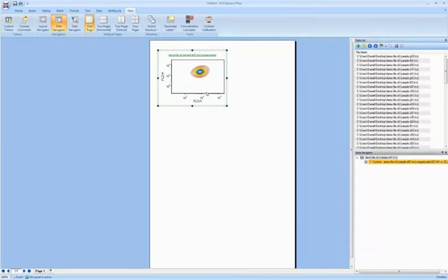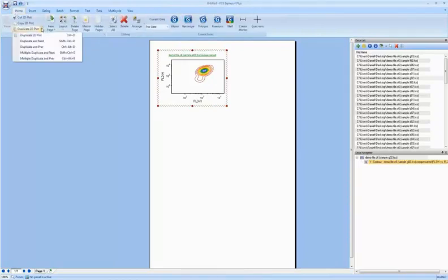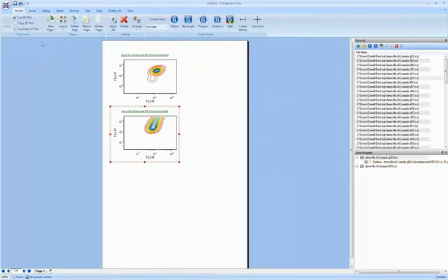And if I try to batch from this plot to the next file, it should switch to G02. As I go into data, I'm going to click next, and it switched to G02, and our Data Navigator updated as well. If you want to actually create a new plot with the next data file, all I have to do is go duplicate and next, and up pops a new plot with the next file in the list, which is F03.